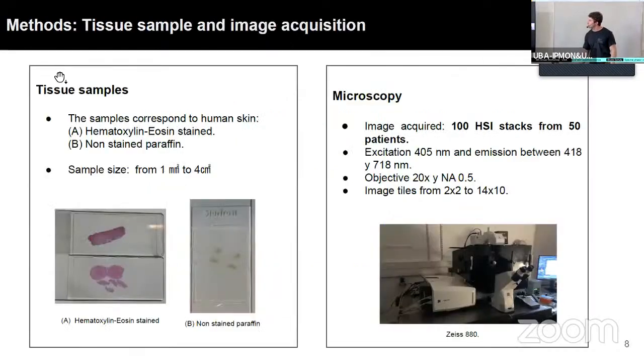So we work with two kinds of samples to compare. Now, can you hear me? Perfect. And then the non-stained paraffin samples, which I use in the microscope.